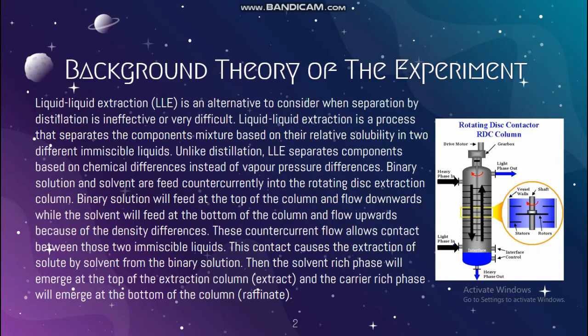This contact causes the extraction of solute by solvent from the binary solution. Then the solvent-rich phase will emerge at the top of the extraction column, which is the extract, and the carrier-rich phase will emerge at the bottom of the column, which is the raffinate.